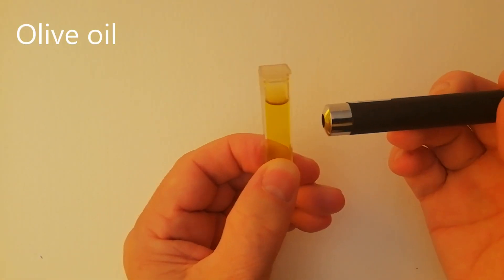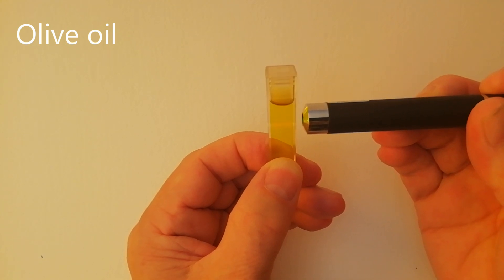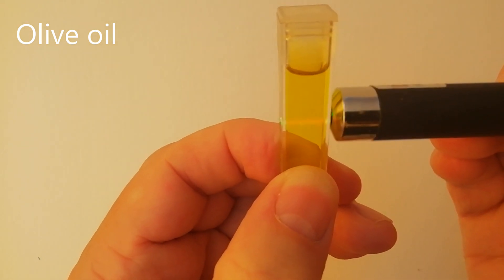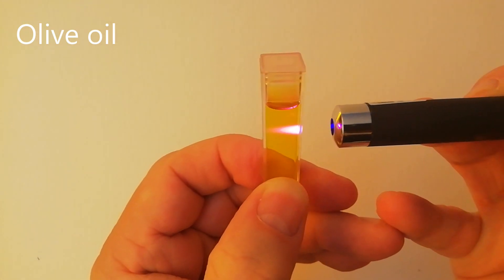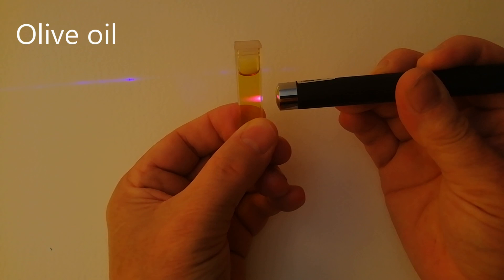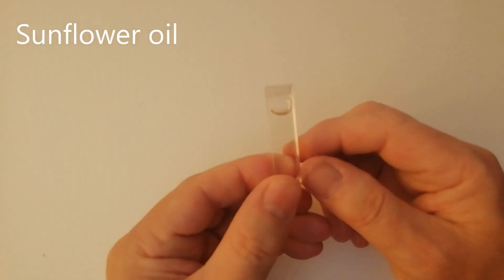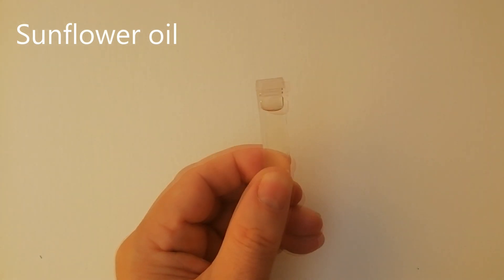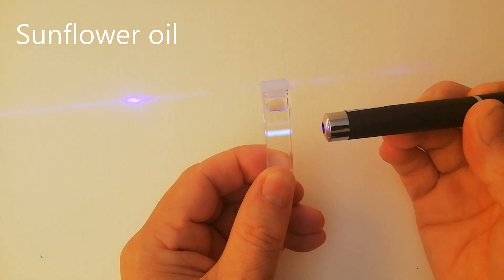This is a green laser pointer shining through some olive oil. Can you see how the beam goes red when it goes through the oil? This is a violet laser pointer and you get the same effect. I've turned the camera exposure down so you can see the colours more clearly. This is sunflower oil. When I shine the violet laser pointer through it, you get this gorgeous white beam.